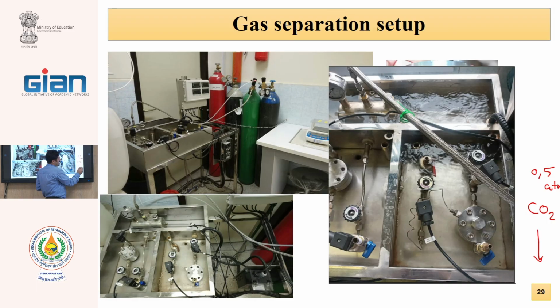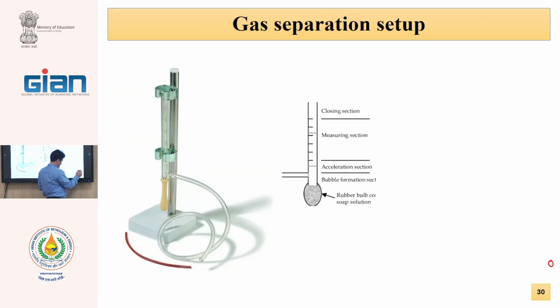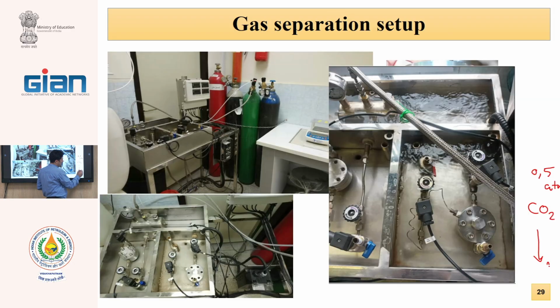The pressure reduced to, after reaching constant condition, for example, 0.3. That means 0.2 atmosphere of carbon dioxide was adsorbed by 1 gram of polymer. Therefore, we can calculate the capacity of gas adsorption on the membrane surface, and there are some equations.